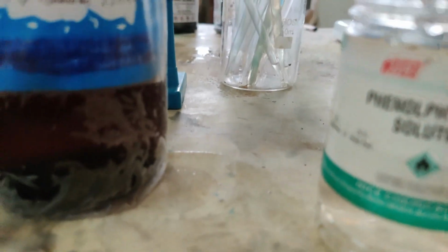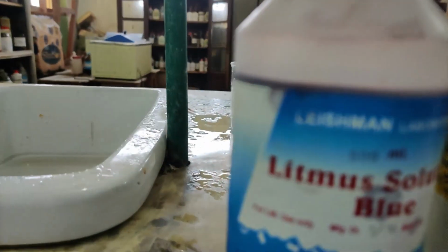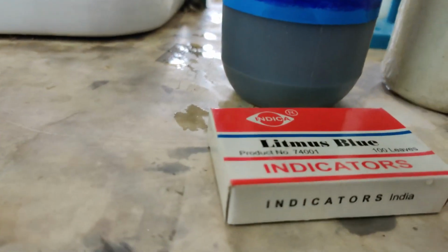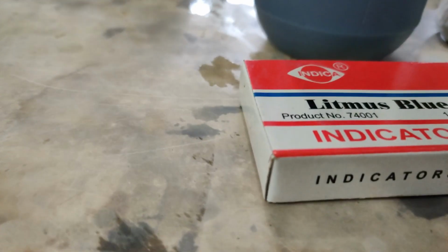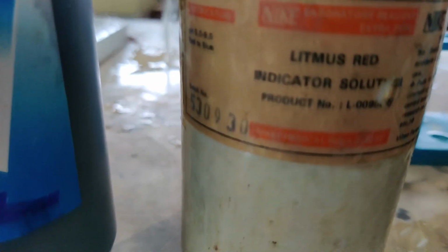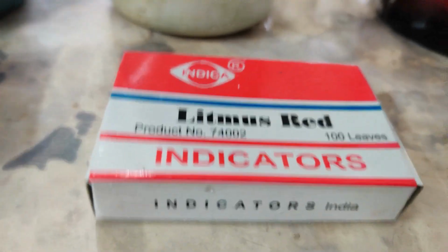Alright, now before I go on to do the practical, I should tell you that blue litmus will turn red if it is an acidic solution, or if you want to test with the paper, then blue paper will turn red. Similarly, red litmus will turn blue in basic solution. Or if you want, you can use the paper.